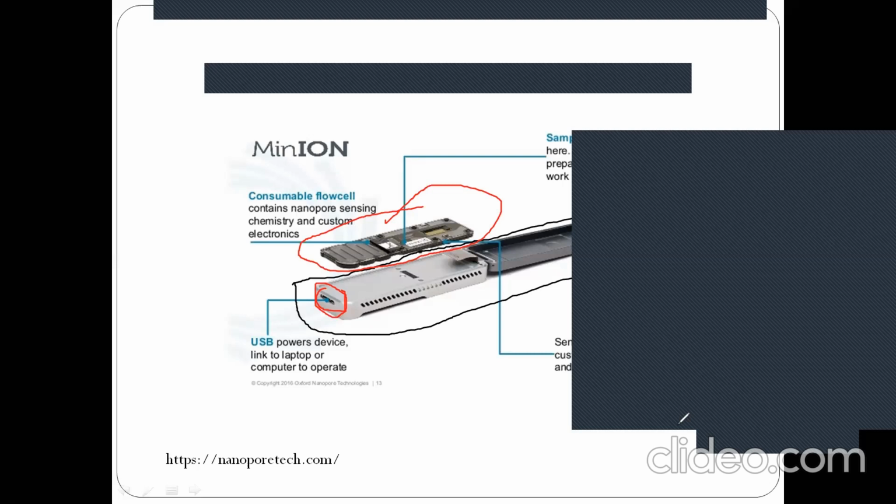But one of the major disadvantages is that not in all 50 sample runs will you get all 960 pores available. Though the manufacturer says 960 pores are available, maybe when you start a run on the 30th sample, you find that all of the pores have already been choked in spite of adequate cleaning.